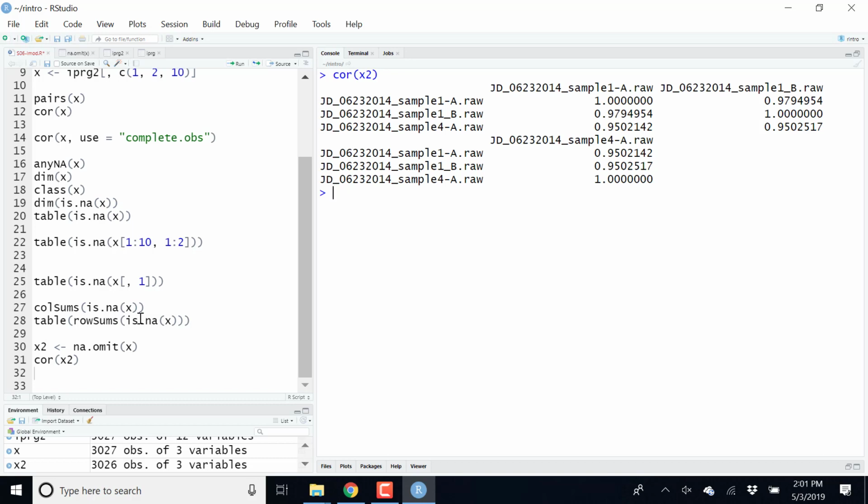We'll look at the correlation of the intensities, but an experiment might be well replicated from a biological point of view. We get the same biological information, even if we have a pretty poor replication. And I know studies and groups that say, oh, look, we have good correlation, so that means that we are able to replicate our experiments. Of course, it's good to have good replication, but worse replication doesn't mean that the biological findings haven't been replicated. So it's easy to calculate correlations, but I think it's also very easy to abuse them.